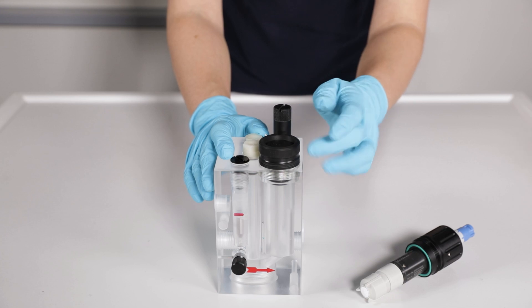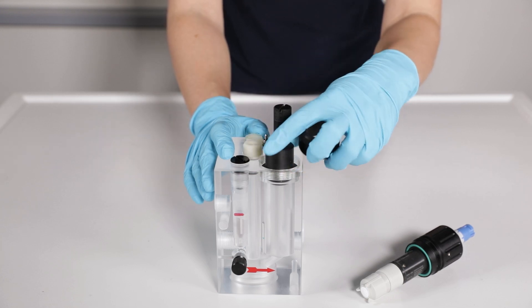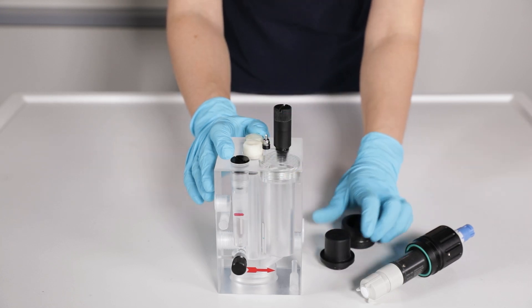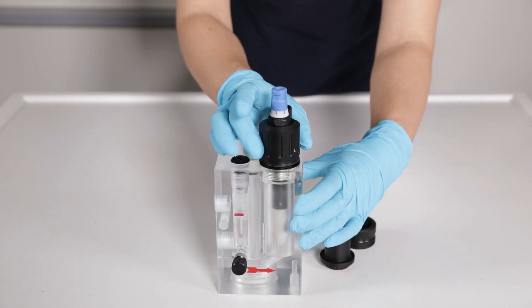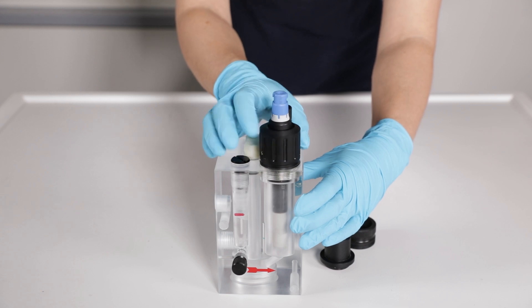For installation into the CCA250 remove the blind plug from the flow assembly and insert the sensor. Screw the adapter onto the assembly.